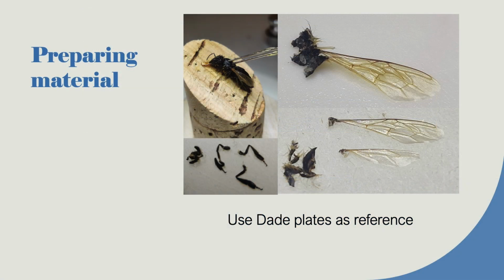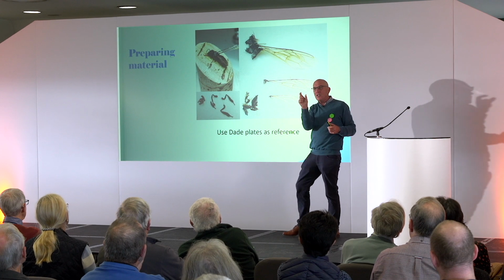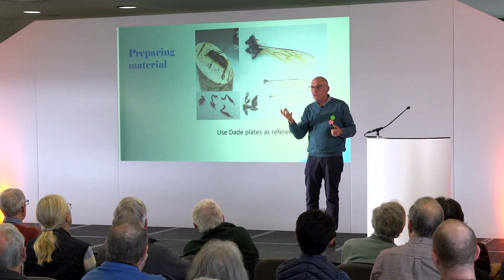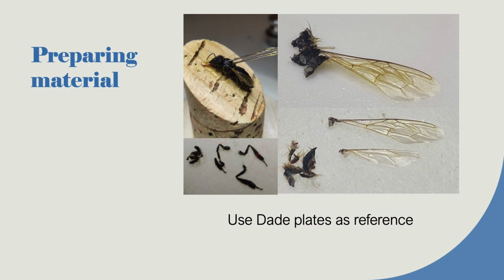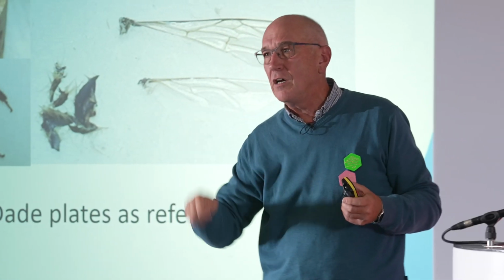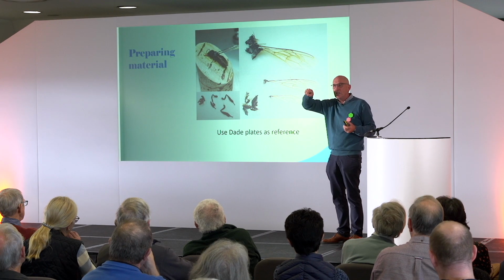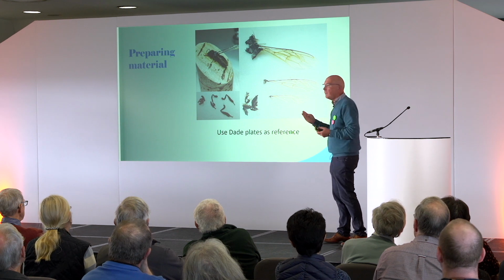When you're preparing an anatomy slide, be really aggressive in taking the parts out of the bee. So when you're taking wings, take the pair of the wings at the same time and all the cuticle around, and then etch it away bit by bit. If you try and take a specimen of a bee which is going to be perfect, for instance, legs, quite often people take legs, and here we are. You've got to get the coxa at the end. And if you try and take it clean and make the cut there, that never comes. So be aggressive on the outside, you've got cuticle, and then etch your way back in, and that then gives you a good slide.